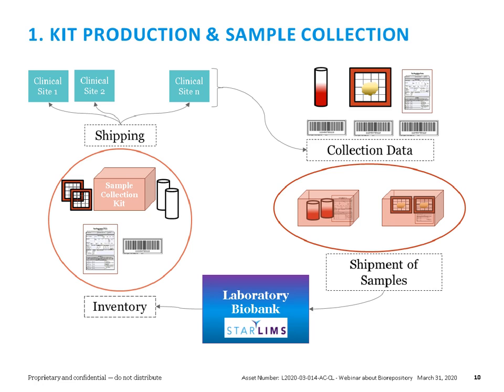Now let's say at this moment the kits arrived to the clinical sites. Clinical sites already have the kits, and they are going to start now collecting the samples, whether they are patients, which is going to be the most common case, but sometimes we could even have animal samples also being collected. But let's suppose we are getting now the samples collected in these kits. At this moment when the sample collection is happening, these consumables, these containers that were intended for the sample collection are no longer anymore just a consumable.